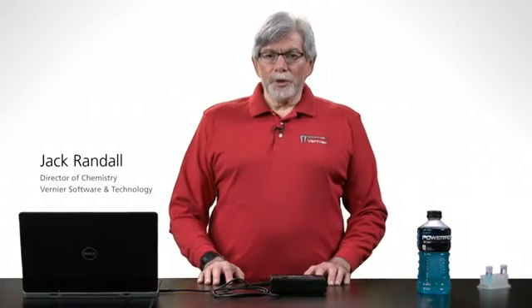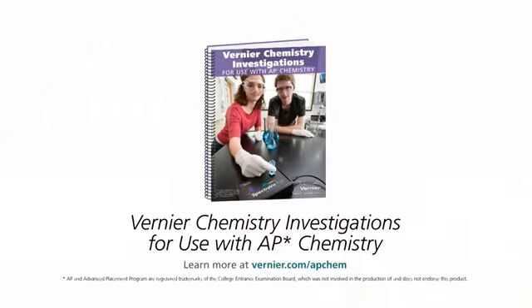In this video, we will be going through a few helpful tips and tricks for completing Lab 1 of Advanced Placement Chemistry Investigations. The goal of this experiment is to determine the amount of food dye in a sports beverage. The example we're going to use today is a sports beverage that contains Blue 1 food dye.